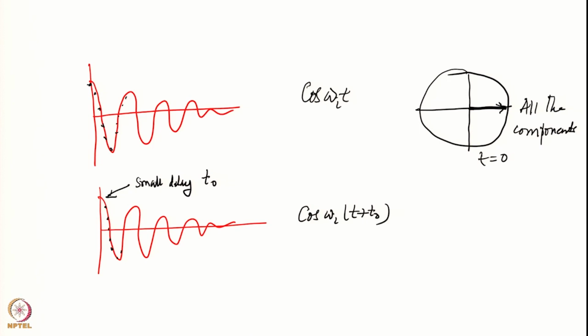Okay. So what does that mean? If I were to represent this in the transverse plane like this, where will the magnetization be to start with? Because T0 is the delay, during this period the different components will have precessed to different extents, right. So during the time T0 the various components would have precessed, although I applied a 90-degree pulse correctly, so that the magnetization came to the y axis, but I did not start collecting from that point.